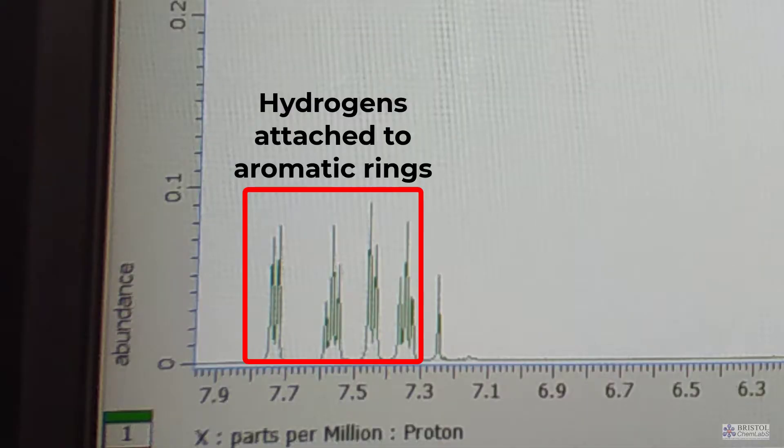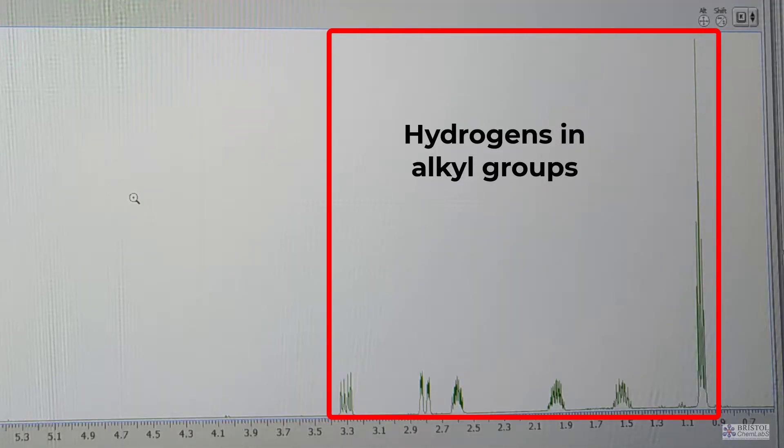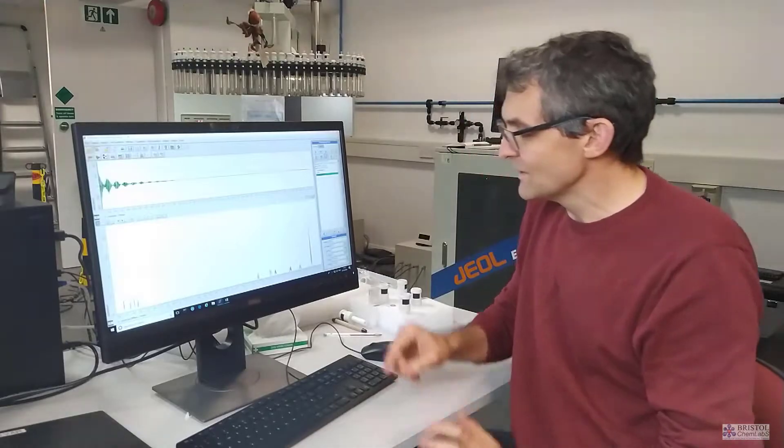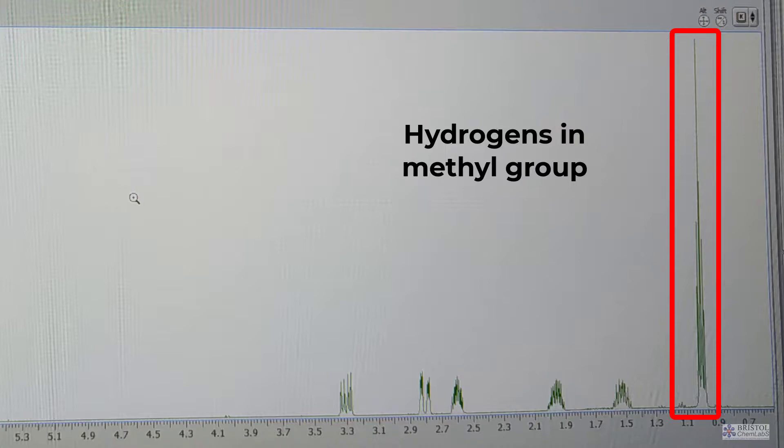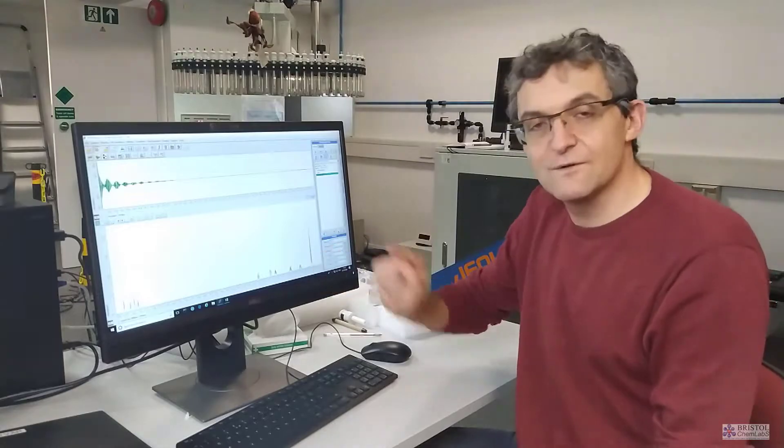We've got four signals down this end, and those are hydrogens that are attached to benzene rings or aromatic rings. So I know I've got a benzene ring in this sample, and it's got four hydrogens attached to it, and therefore it's got two other things attached to it. Down here, I've got six signals. Those are hydrogens attached to what we call sp3 hybridized carbon. This really big one here is a methyl group, because you've got three hydrogens on the methyl group and they're all identical to each other. So they give this very strong signal.